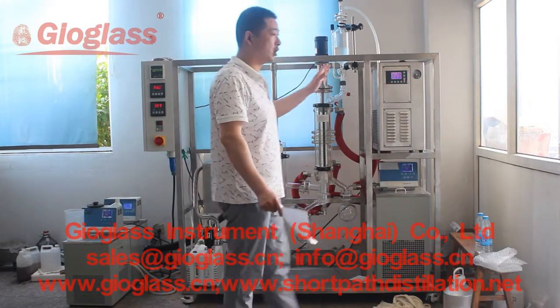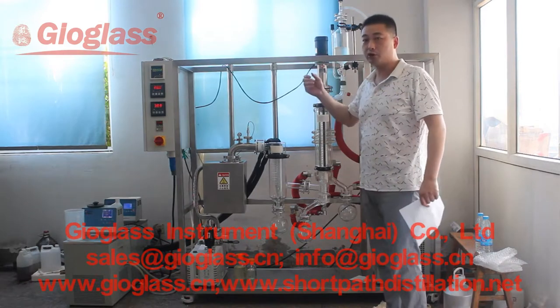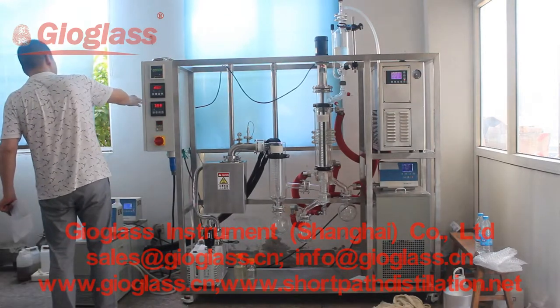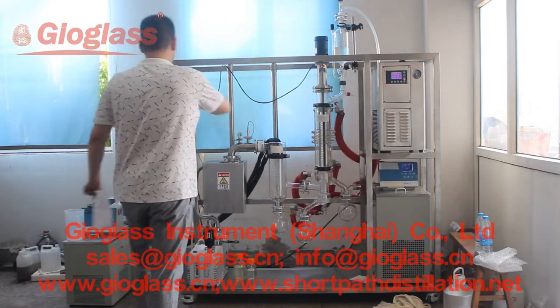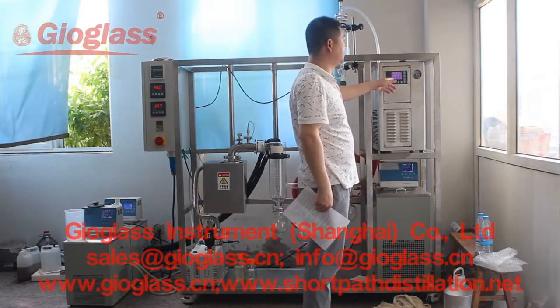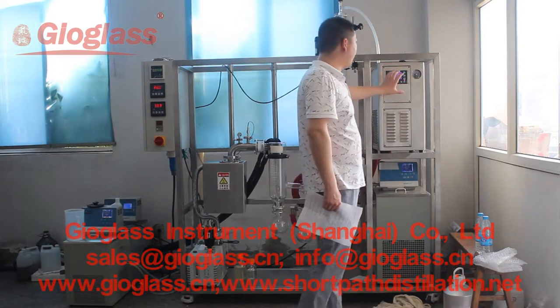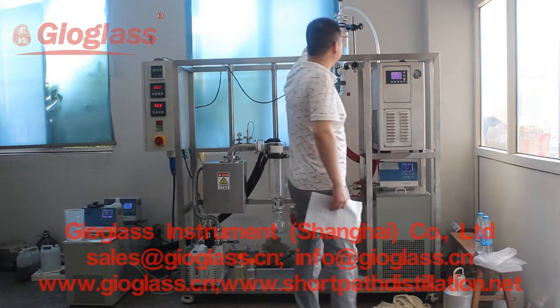Before we start our trial today, we should open the power here — and on the back side, the power here. We will turn on the heating circulator and the chiller first. When the temperature reaches our target, then we start to feed.